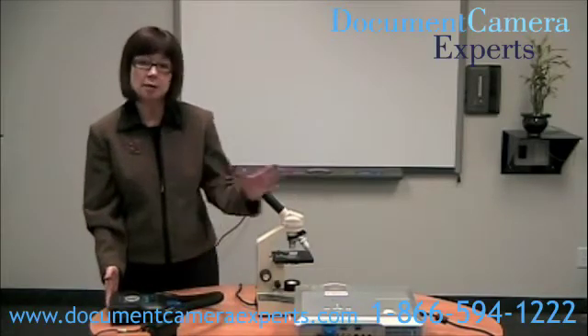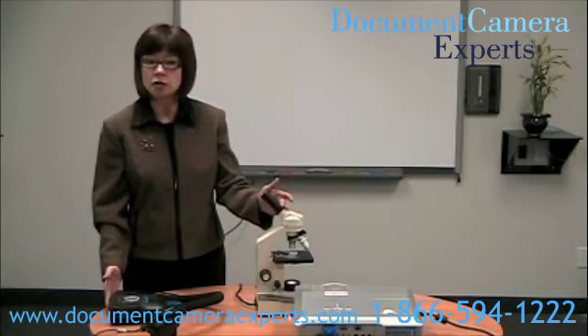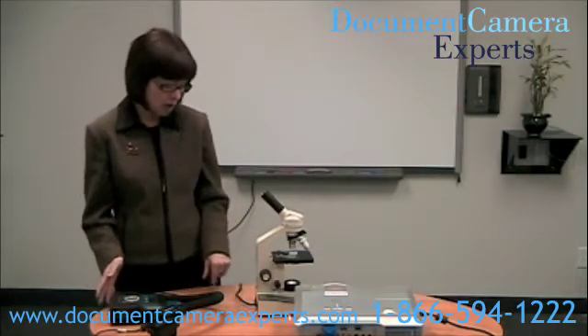Here we have an AverMedia CP300 and a microscope because we want to project an image from the microscope onto a wall or screen. I've previously connected the projector to the AverMedia CP300 using a VGA cable, and I've also powered both items on.